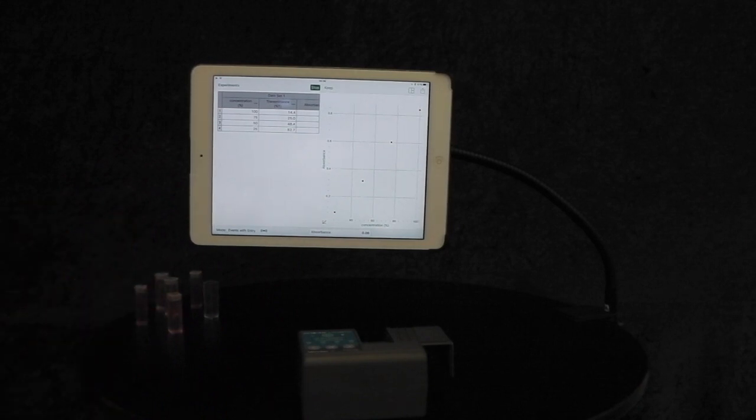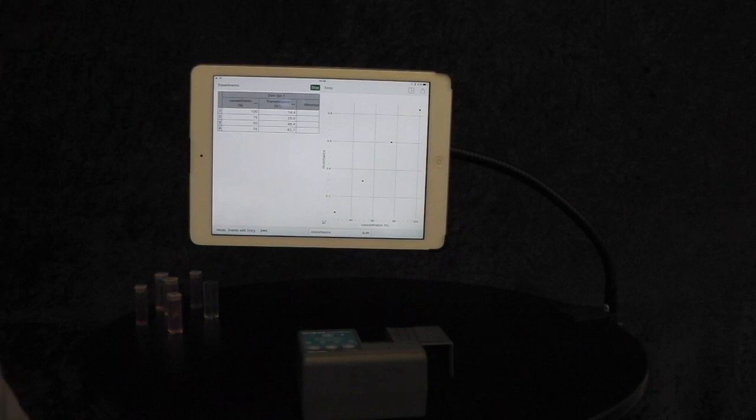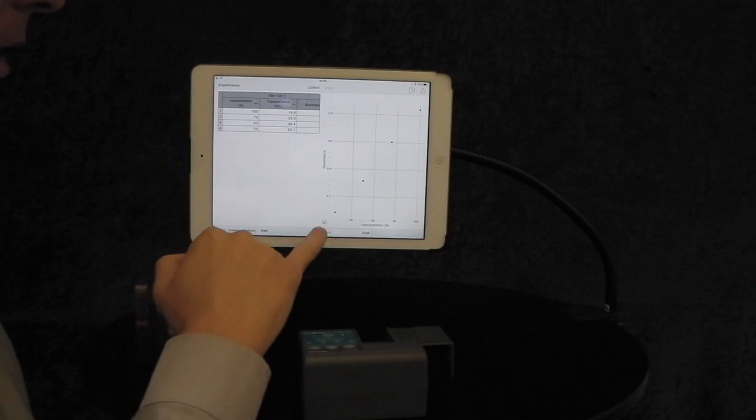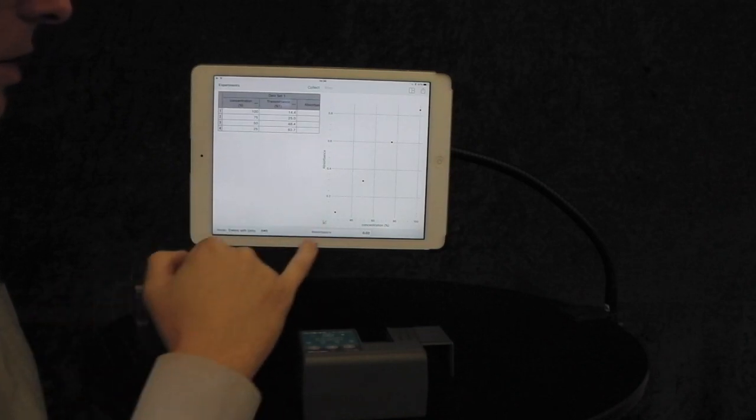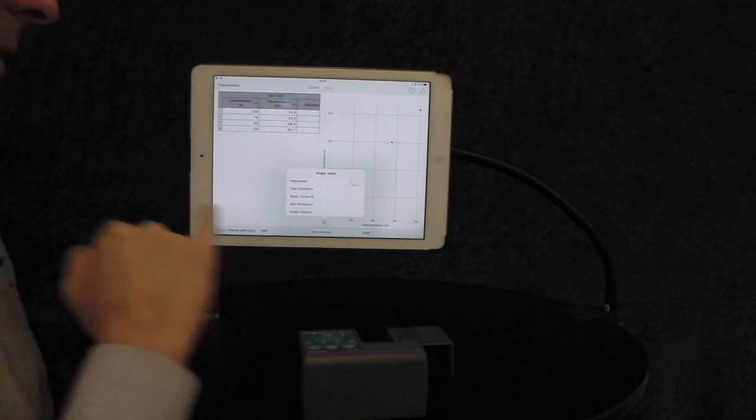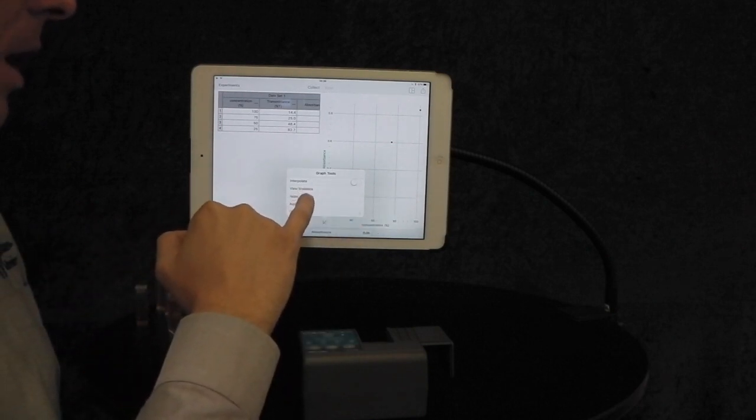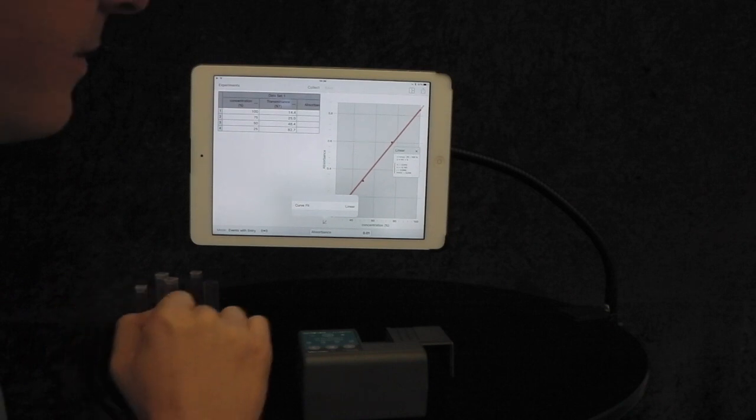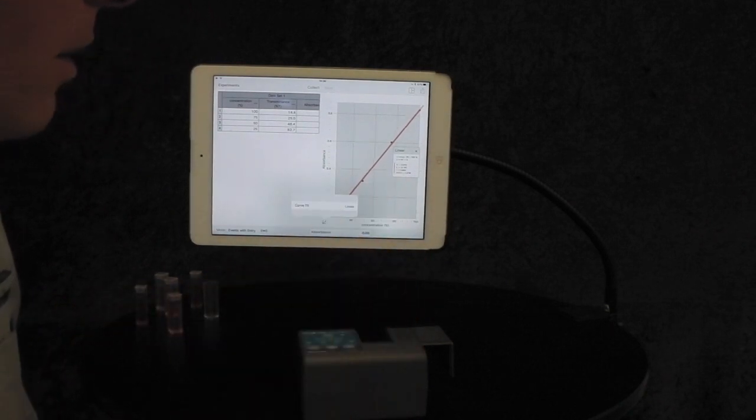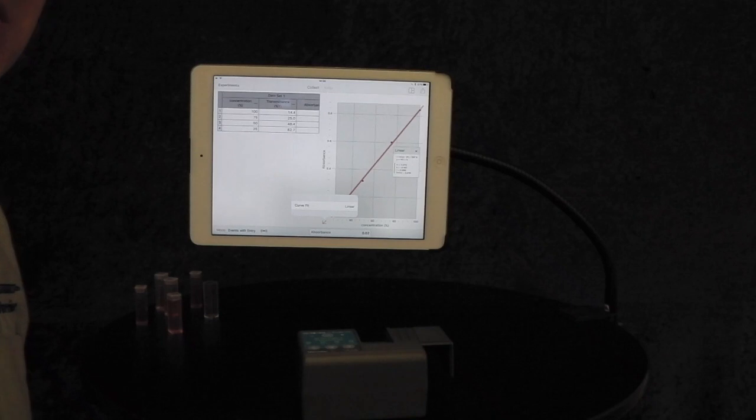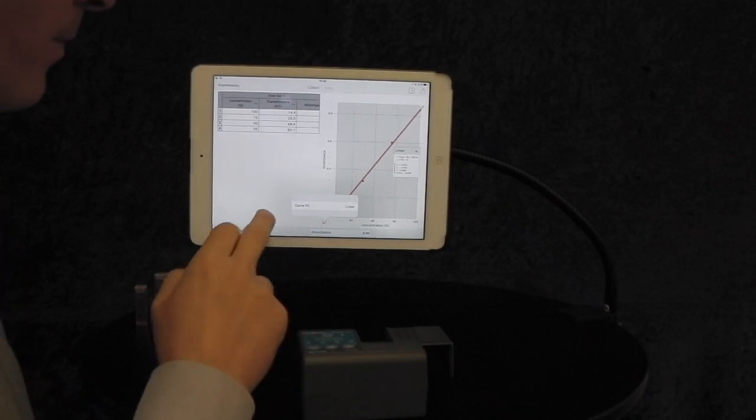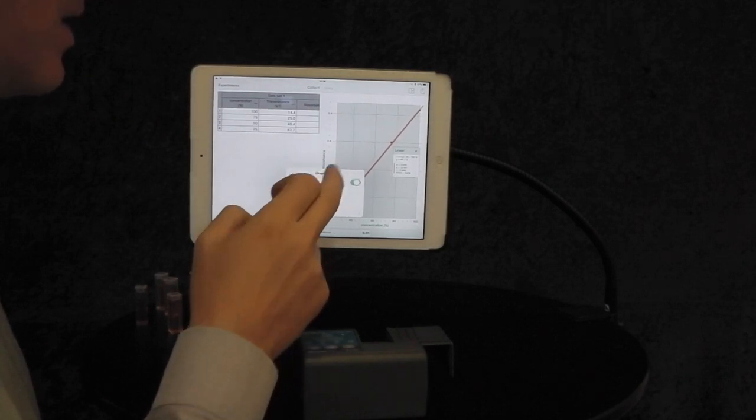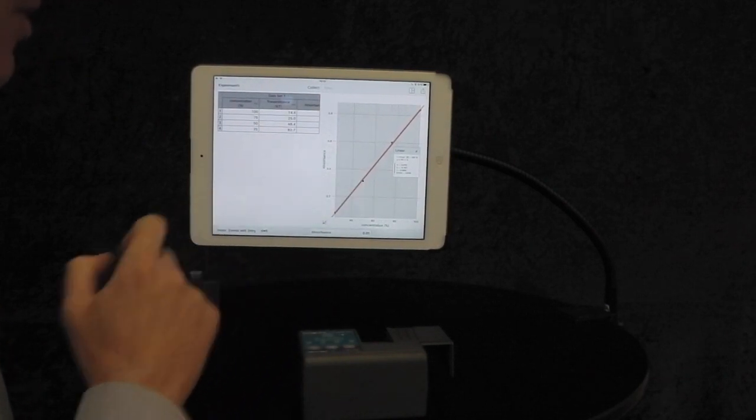As you can see, there's quite a nice linear relationship between those points. We are now going to stop the experiment. Click on the icon to add a curve fit in the bottom left hand corner of the graph. Click Apply Curve Fit. We get a nice curve fit and we get an R value of 0.999, which is pretty good. One would be absolutely perfect.